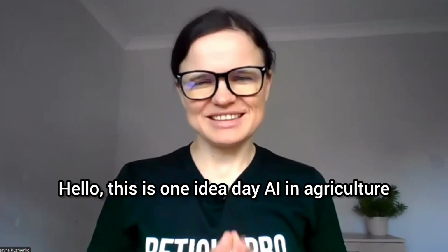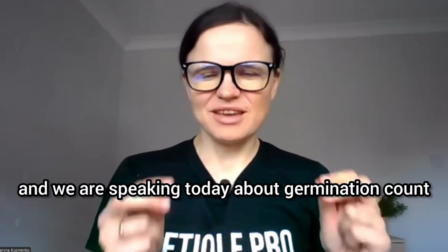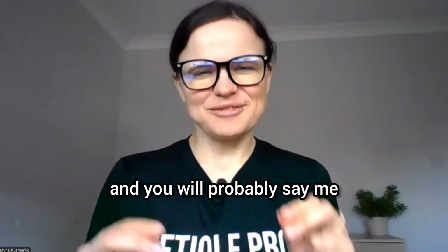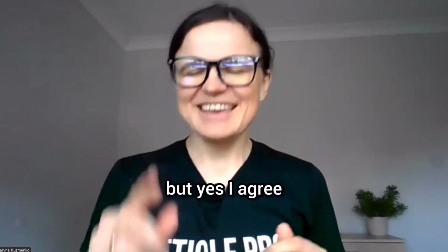Hello, this is One Idea a Day, AI in Agriculture, and we are speaking today about germination count. And you will probably say that we already spoke about germination count, but yes, I agree.